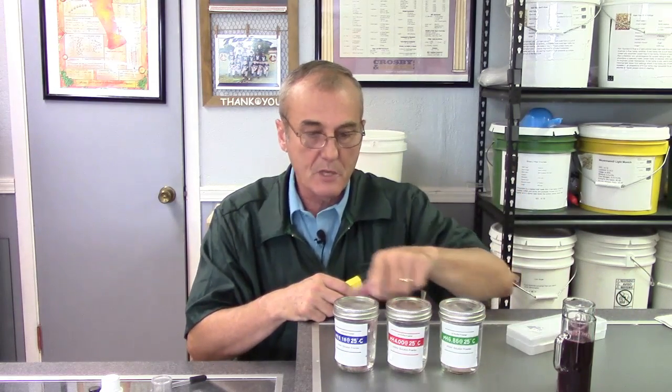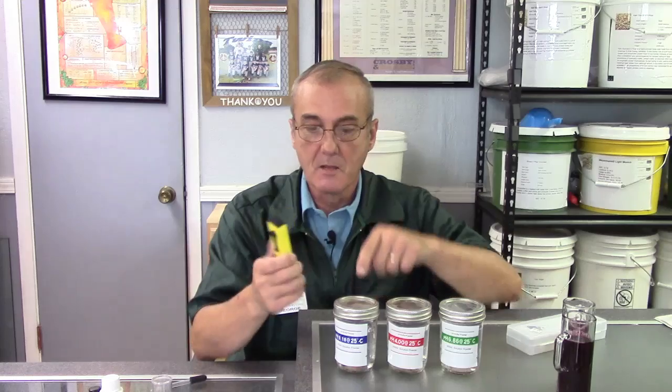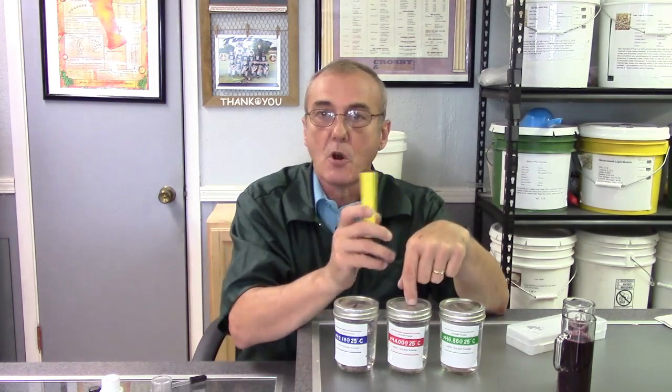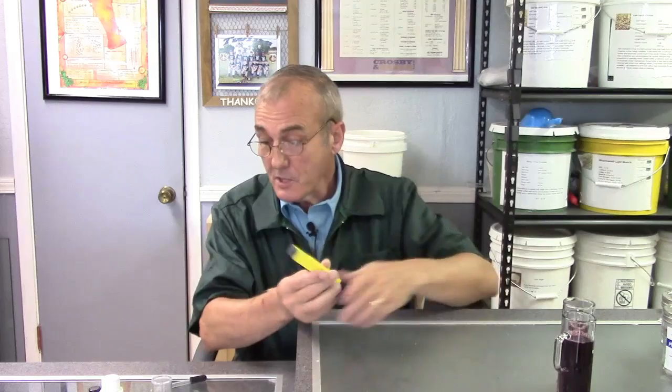I made three jars and every time I need to recalibrate my pH meter I just open the jar, stick it in, read it, and make sure the reading matches what we know it should be. I'll go to the next jar and the next jar just to make sure it's all rounded out and the pH meter is working correctly.